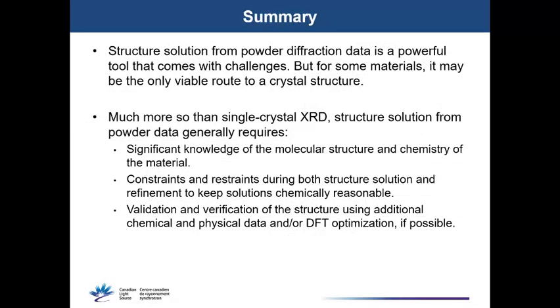So hopefully I've convinced you that structure solution from powder data is a really useful tool. It certainly comes with its challenges, but for a lot of materials, it can be the only way you can get to a viable crystal structure. Much more so than single crystal XRD, structure solution from powder data really requires that you have significant knowledge of the molecular structure of your material ahead of time. You definitely have to use constraints and restraints to keep your structure solution and refinement chemically reasonable. And you really want to validate your structure if you can, with another method. DFT is excellent for that, but there are other experimental ways as well.